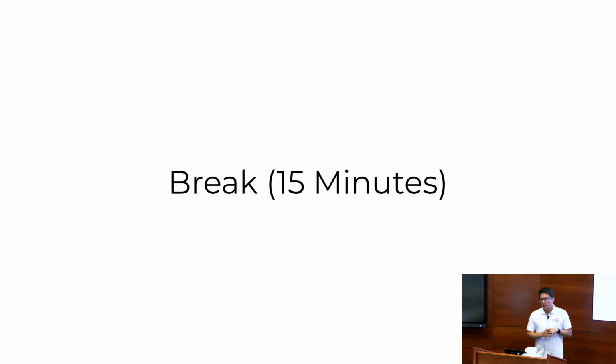Okay. Now Ilastik is an alternative, right, for segmentation. It's cross-platform, so it works on Linux and Windows, maybe Mac OS as well. It's free and open source, which is amazing. And you don't need a GPU. So actually for today's demo, I'm just going to use CPUs, okay? So you have the option to use CPUs or GPUs. Of course, if you have GPUs, it's going to be faster, okay?